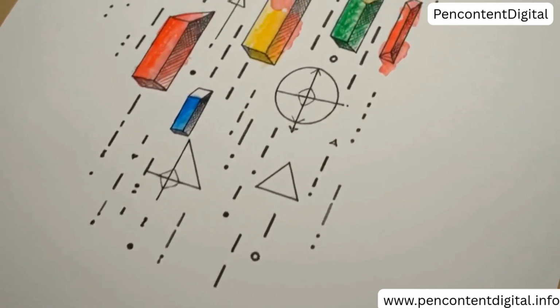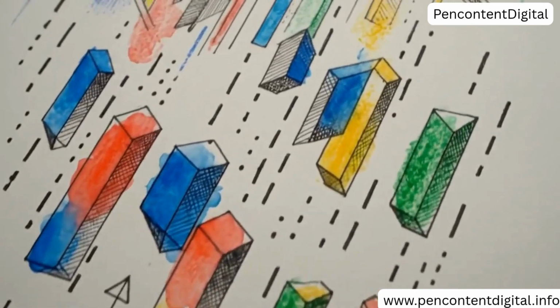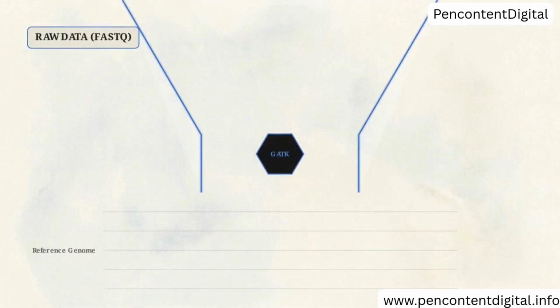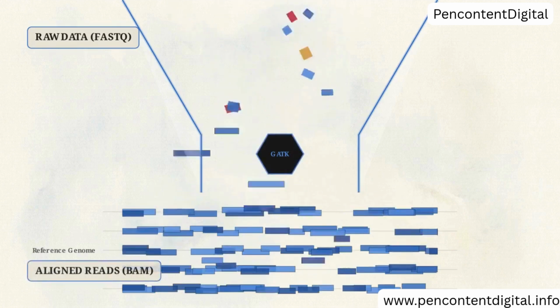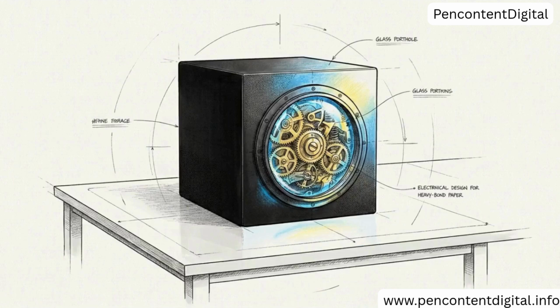This is raw FASTQ data. Every minute, modern next-generation sequencing hardware generates millions of lines of unstructured text exactly like this. To process this volume, bioinformaticians rely on automated algorithmic pipelines and statistical variant callers to sort, align, and filter the data. However, these statistical tools often operate as a black box.